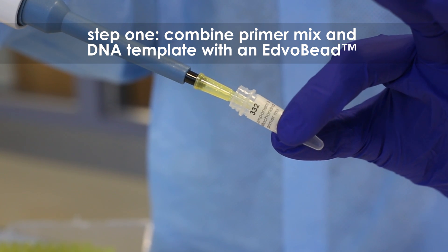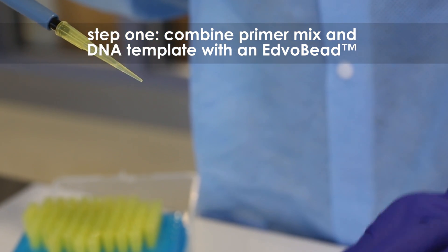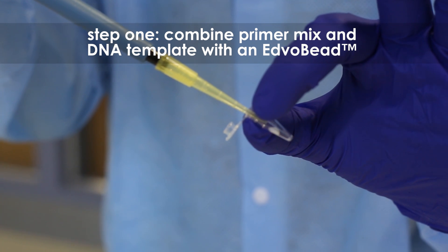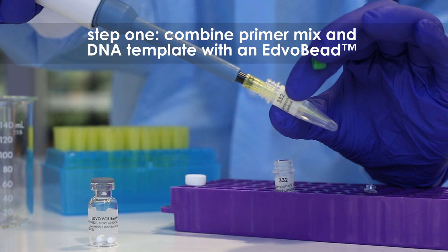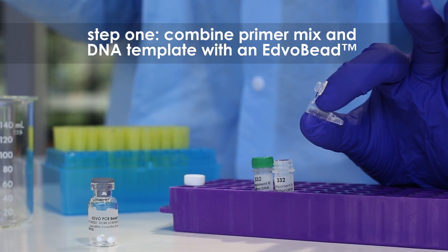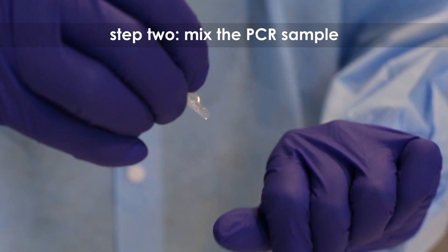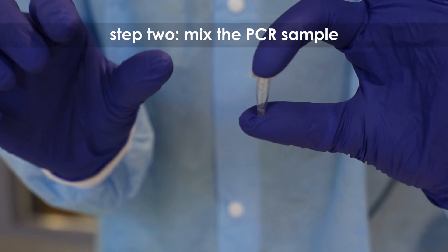Step 1: Combine 20 microliters of primer mix and 5 microliters of DNA template with a PCR Edvo bead in a PCR tube. Step 2: Mix the PCR sample. Make sure the PCR Edvo bead is completely dissolved.